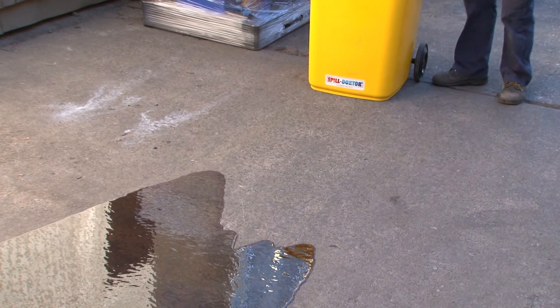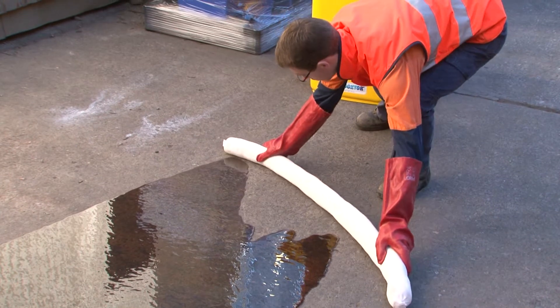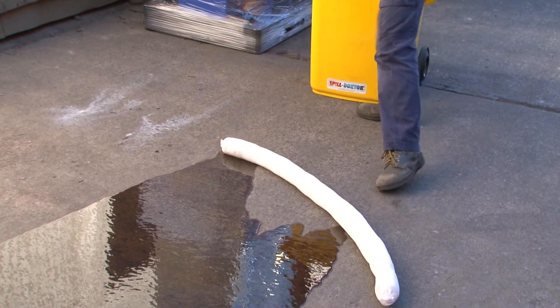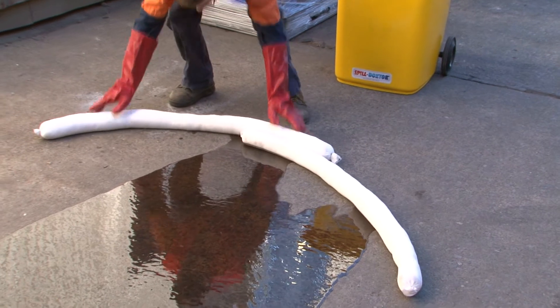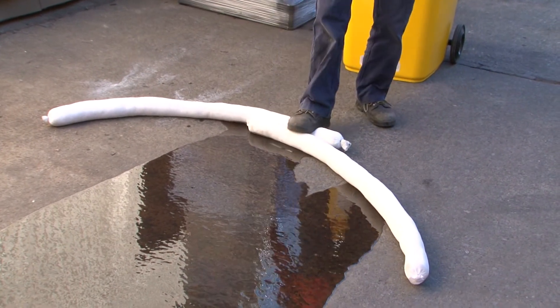Place the mini-booms around the spill to create a barrier. This is a simple step that has little risk of contact with the liquid and helps to contain the spill. If you are unsure of the liquid, this is a safe containment method until identification is confirmed.